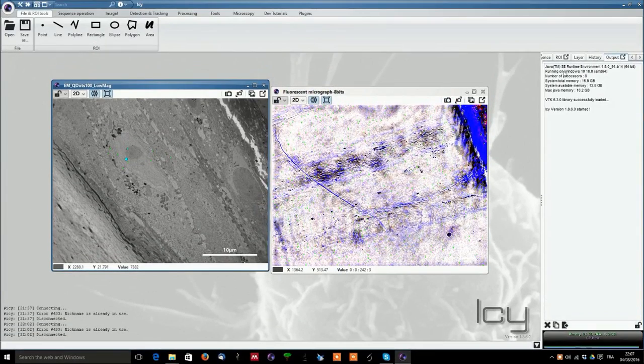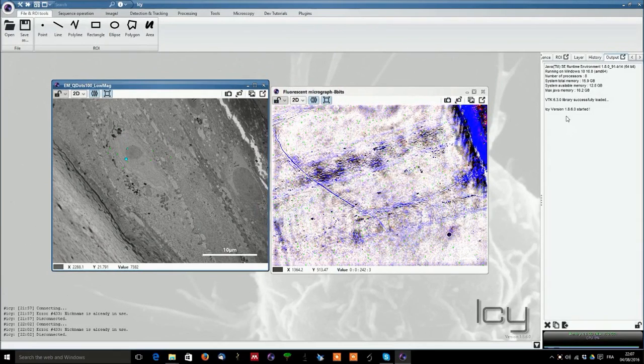You also have here the output that contains different information about your system and the different processing you will be doing.